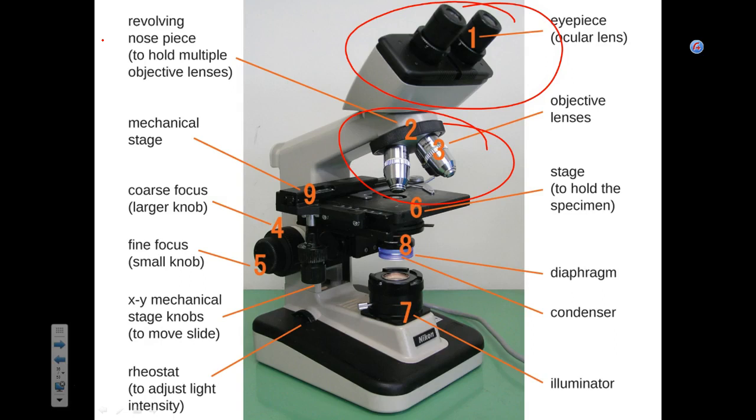If you want a really good picture, you have to go to oil immersion. The problem with oil immersion is that it works about 80% of the time. So make a really good sight with high power.